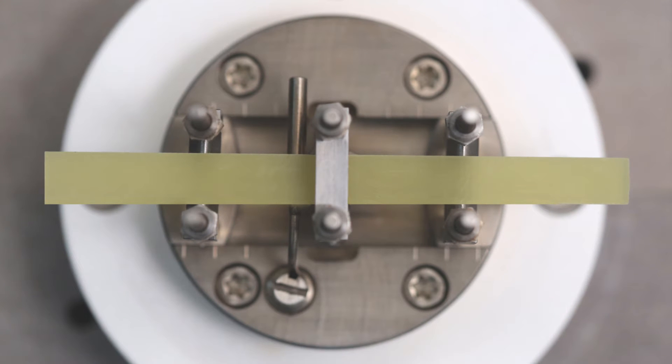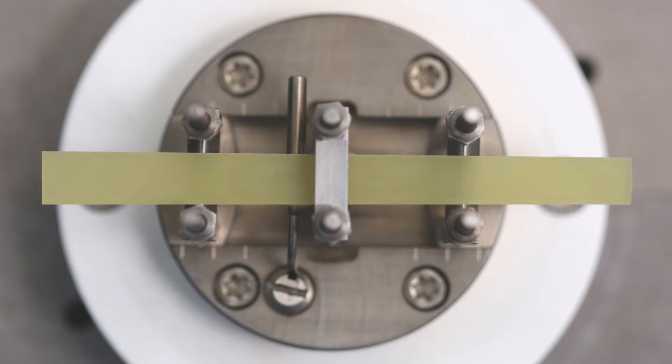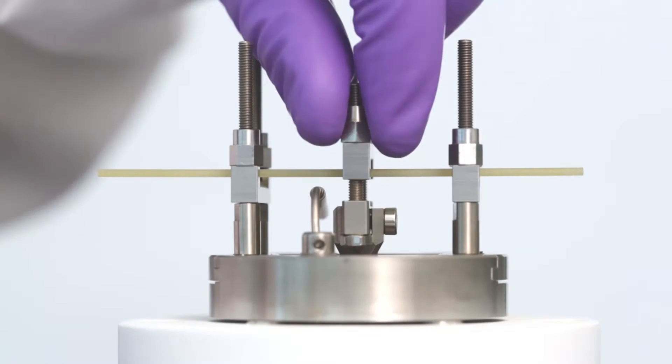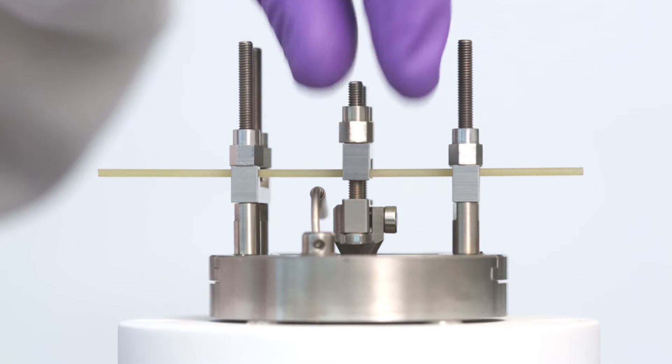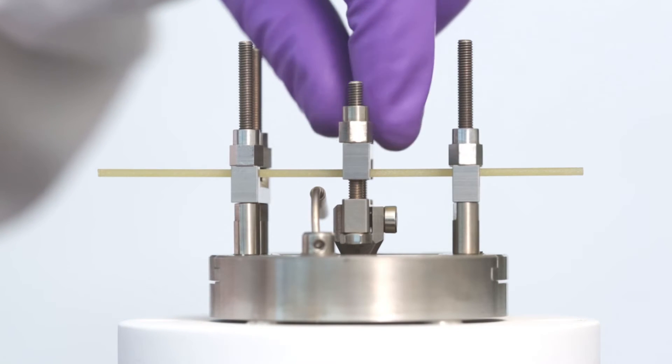Now, we need to check that the sample is positioned straight in the clamps and the sides are not in contact with the clamps. Once we are happy with the position of the sample, we can finger tighten the two extended nuts on the central clamp.